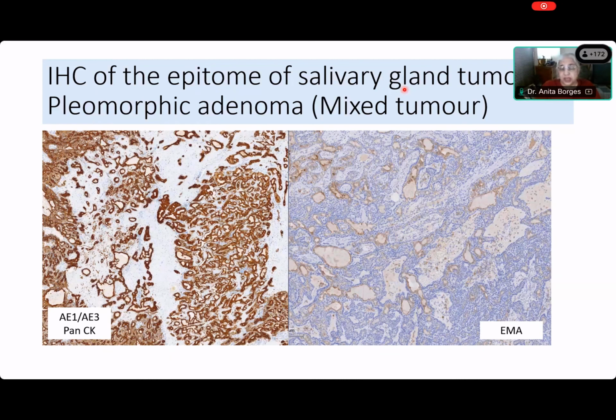Come on, Akshara. What are basal cells like? They have scant cytoplasm. They are small to intermediate sized cells. They may be ovoid, cuboidal or elongated, they may be anything, but they have scant cytoplasm and a very high nuclear cytoplasmic ratio. That's why they look blue, because they're nearly all nucleus and no cytoplasm. Now, this is not something that I need to tell you at this stage when I'm doing salivary gland tumors, for God's sake. So these are basaloid cells, and many myoepithelial cells have a basaloid character, because they have very little cytoplasm and a bland nucleus, which forms most of that cell because there is so little cytoplasm around it.